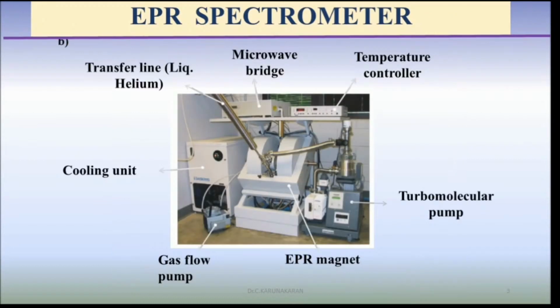This is the actual EPR spectrometer. These are the electromagnets. This is a microwave bridge and microwave guide, and you have a temperature controller and liquid helium to measure low temperature EPR.